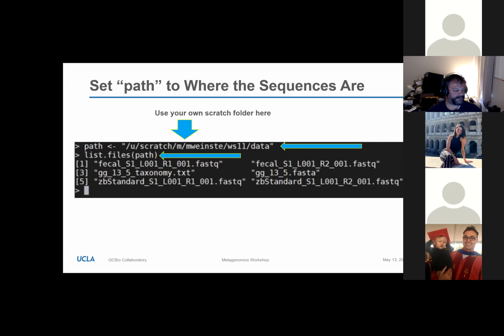So, quick show of hands, who out there has done microbiome preps before? All right. Also, quick show of hands, who out there has heard of gram-negative biases or overrepresentation of gram-negative organisms in microbiome preps?